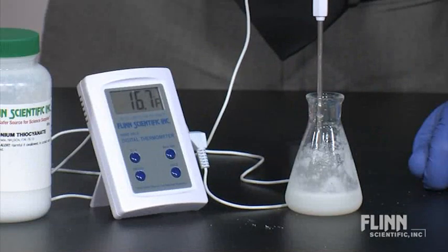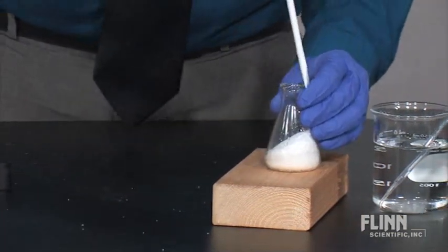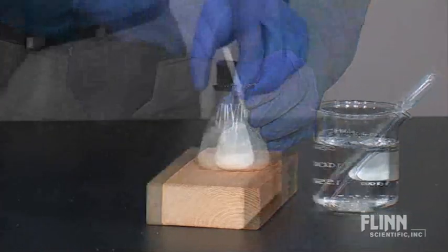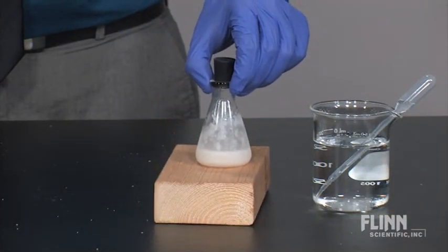A thermometer may be used to show just how low the temperature can get. For a more stunning display, place the flask on a small wooden board with a few drops of water. The temperature of the reaction is low enough to freeze the water and board to the flask.